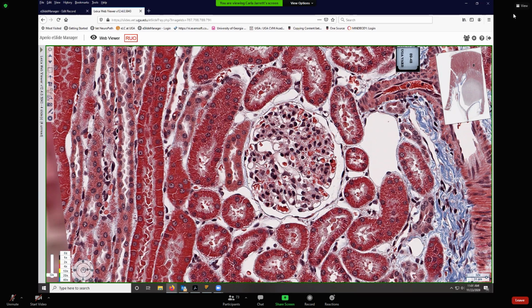So when you push your fist in, the part of the balloon that you're contacting is tight around your fist, but then there's an air-filled space, and then there's the rest of the balloon on the outside. That's exactly what we have here. So this capillary tuft, the layer that's just tightly adherent to the outside of the capillary tuft, that is your visceral epithelial layer, and that is your podocyte layer. But then this is your parietal epithelial layer, and this parietal epithelial layer is continuous with the proximal convoluted tubule when it starts at that urinary pole. And of course, this is your urinary space.